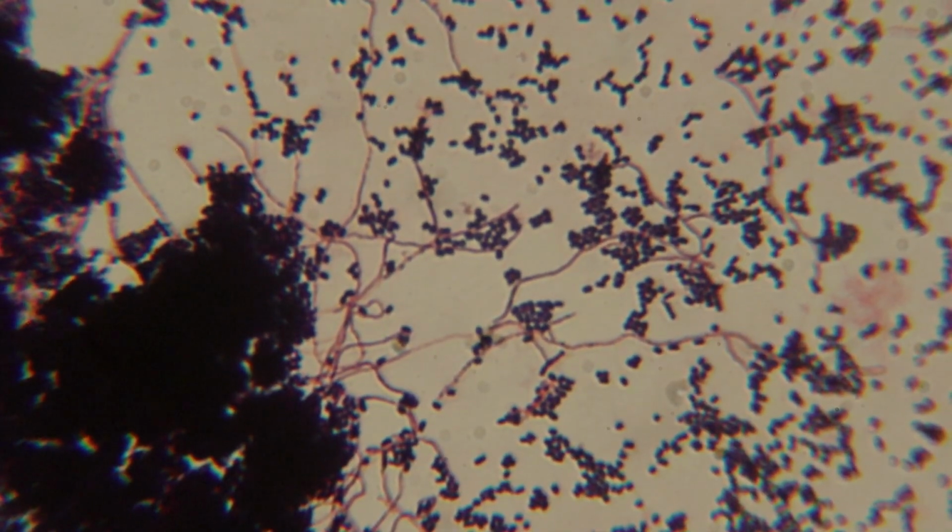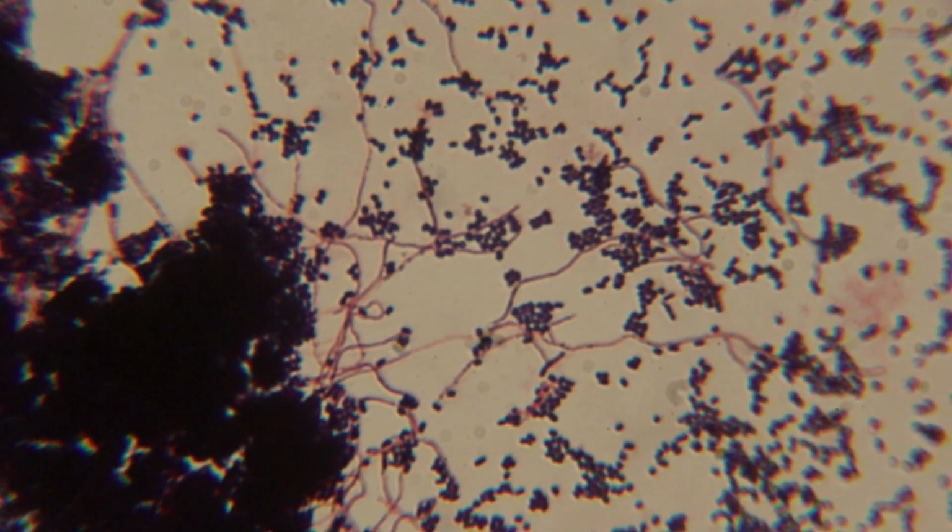And this time, when I put the slide under the immersion lens, I saw perfect gram-positive circles! Yes! Finally, found out why I wasn't staining properly. I just suck at heat fixation, apparently, and methanol fixation was the way to go. I should have just done methanol fixation from the very beginning. And now that we know it's actually Streptomyces because it's gram-positive, all I'm left with are 20 or so plates of Streptomyces and a big stack of lessons learned.